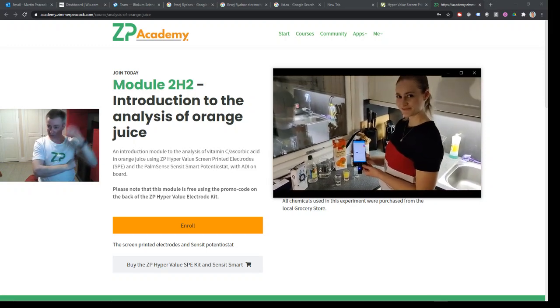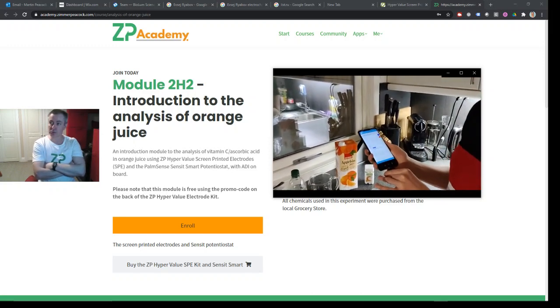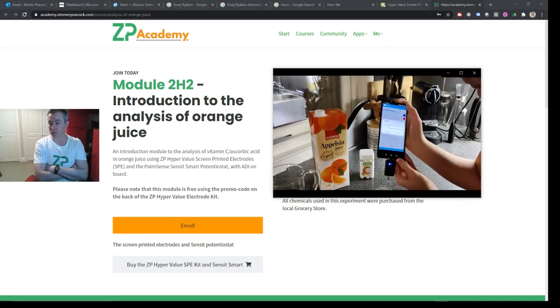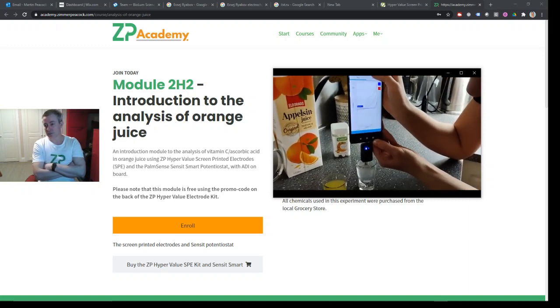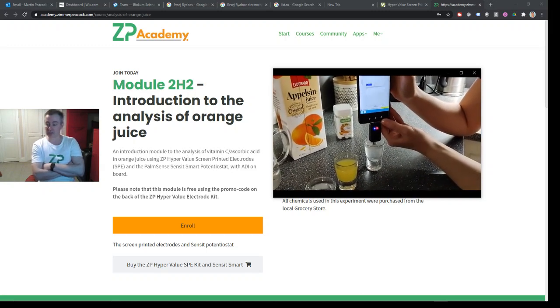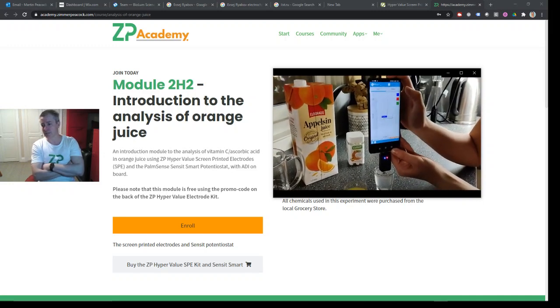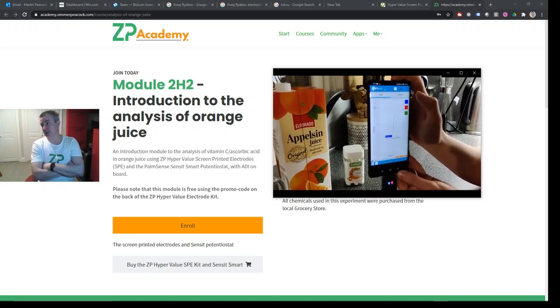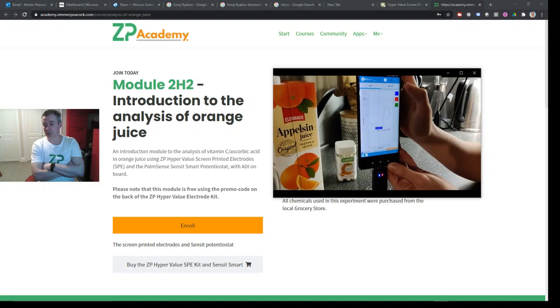The software allows them to display both the vinegar signal and the orange juice signal together. Anna's laughing because the experiment is actually quite simple — that's one of the beauties of electrochemistry. Now they've taken an effervescent vitamin C tablet, dissolved it in vinegar, and they get a massive wave due to all the ascorbic acid, or vitamin C, in the solution.